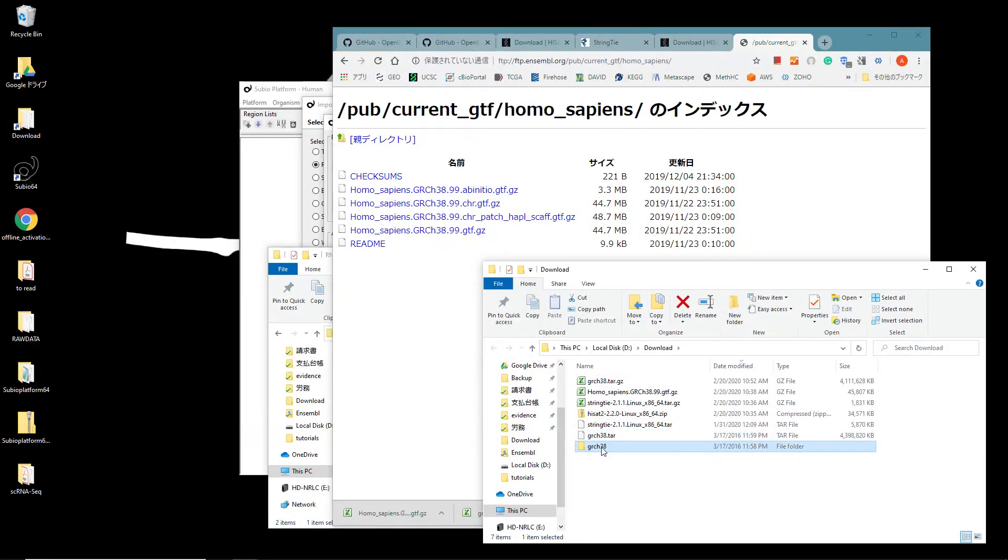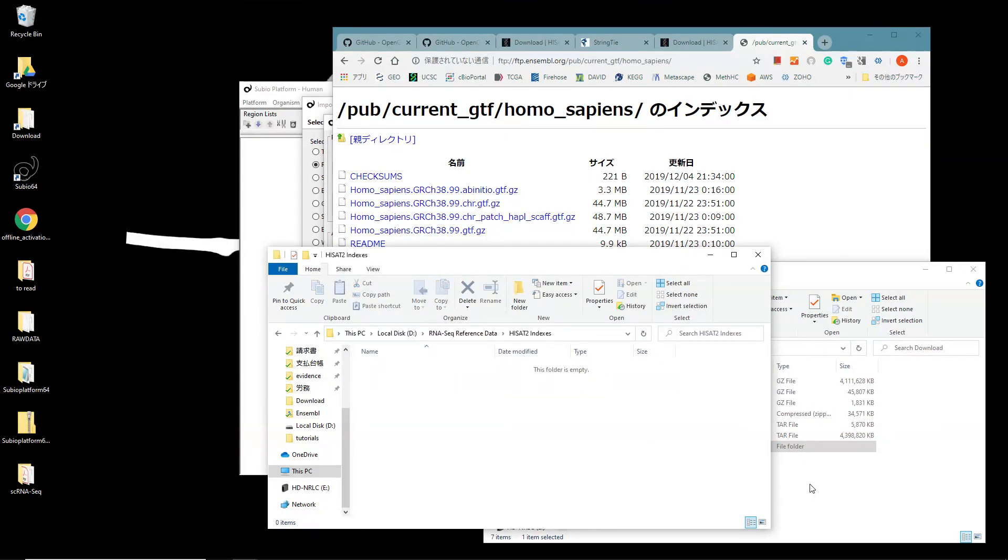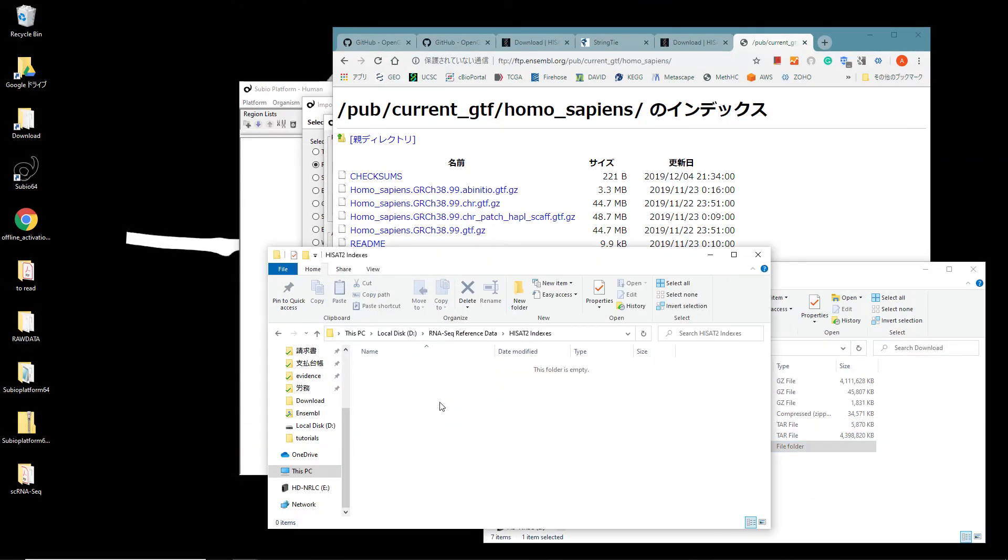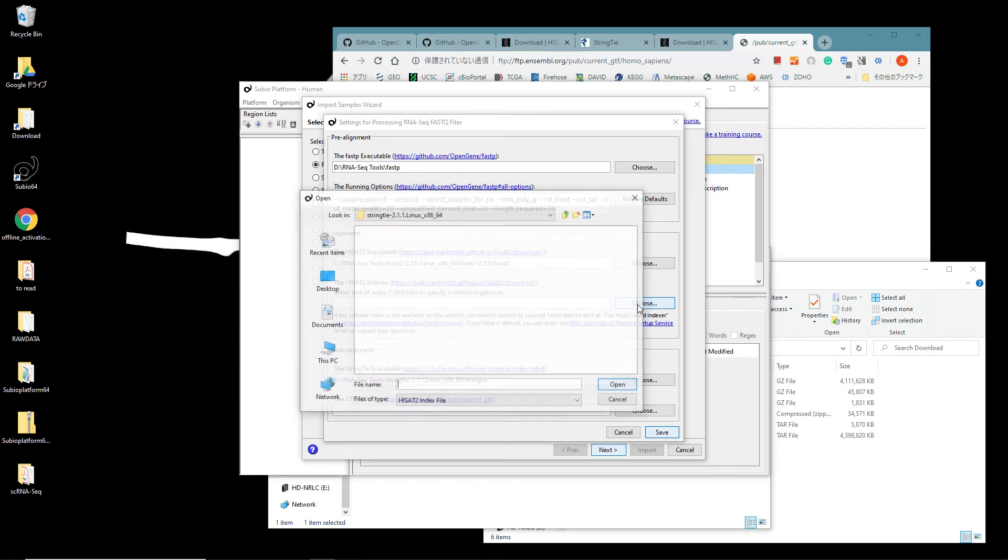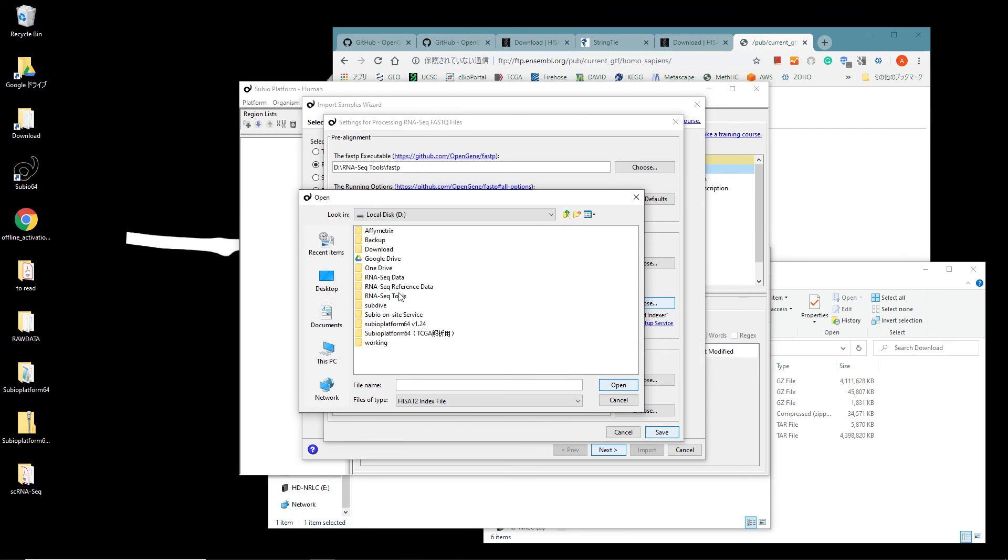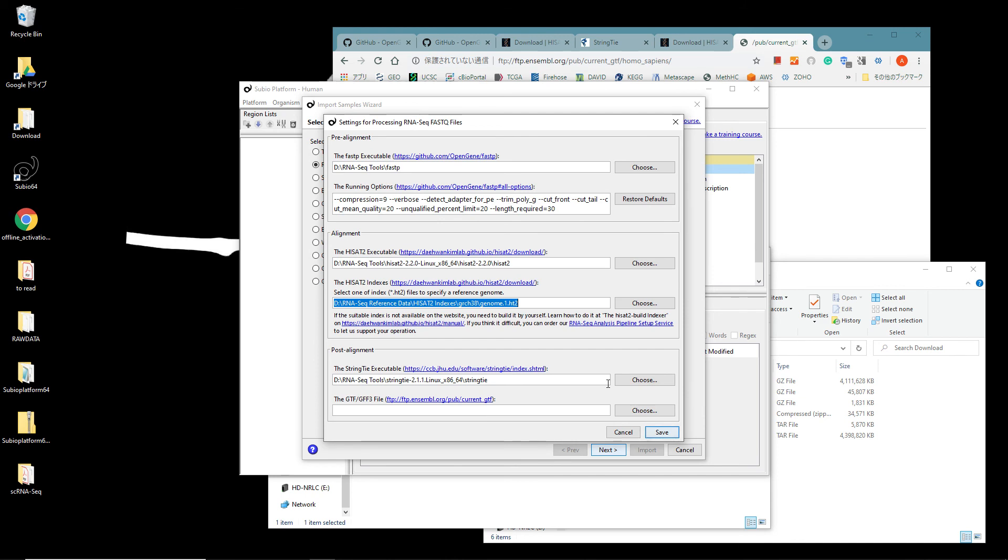Move the extracted folder under the HISAT2 indexes folder. Go back to the Subio Platform's setting panel. Click the Choose button at the HISAT2 indexes section. Open the path RNA-Seq Reference Data, HISAT2 indexes, GRCH38, and then select one of the .ht2 files.